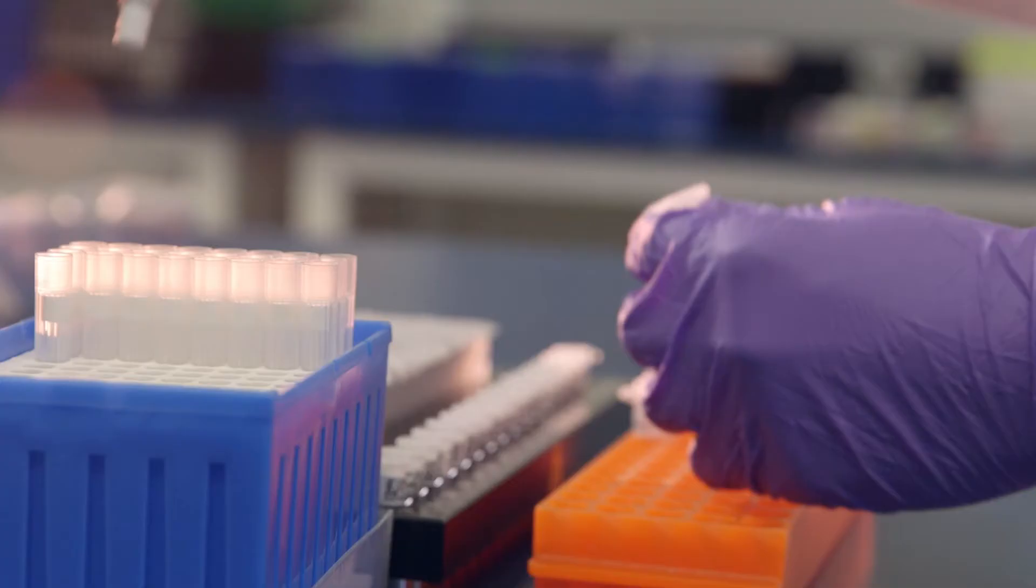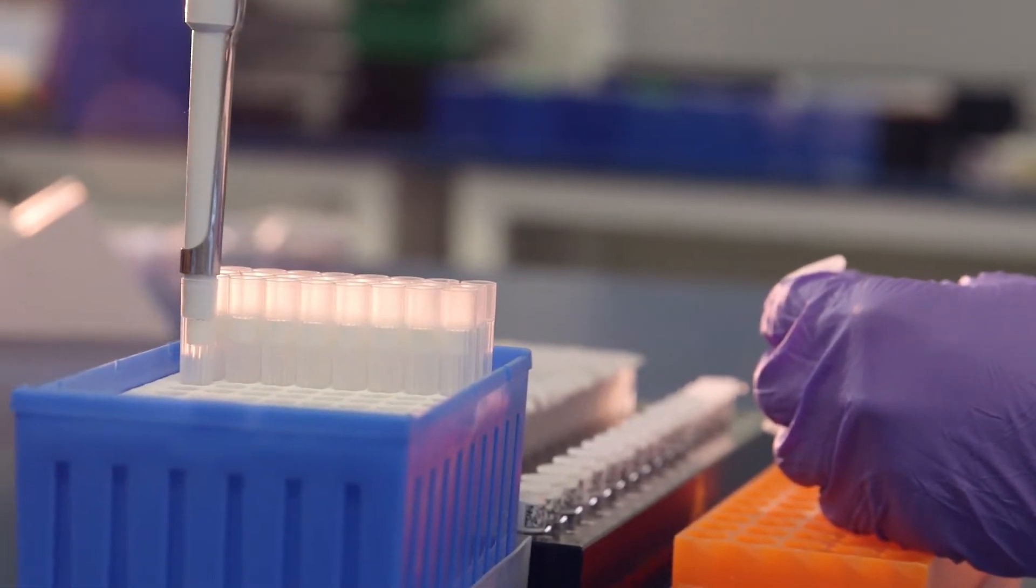Once our pathologist accepts the sample for testing, the DNA or RNA from the sample is extracted.